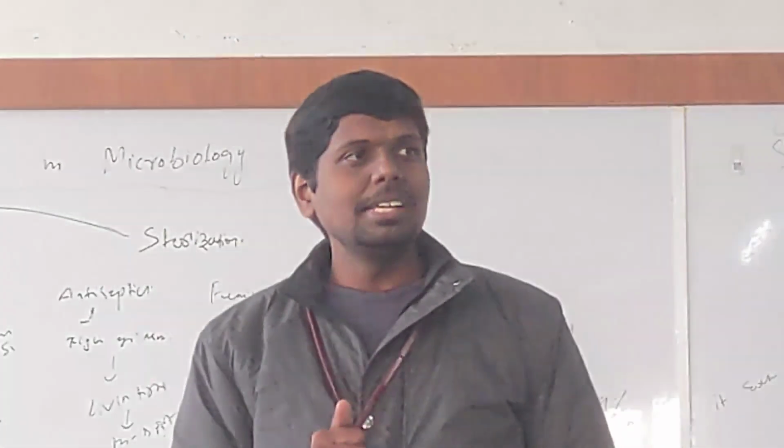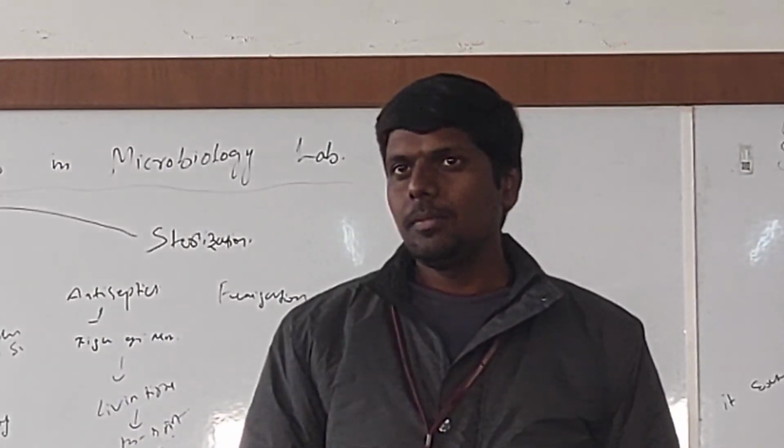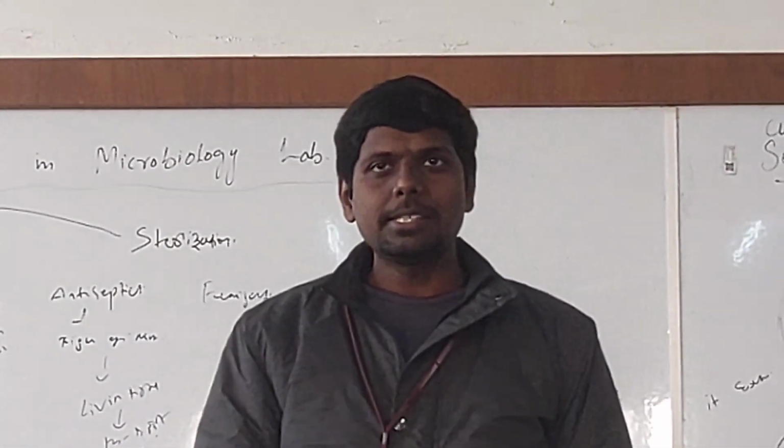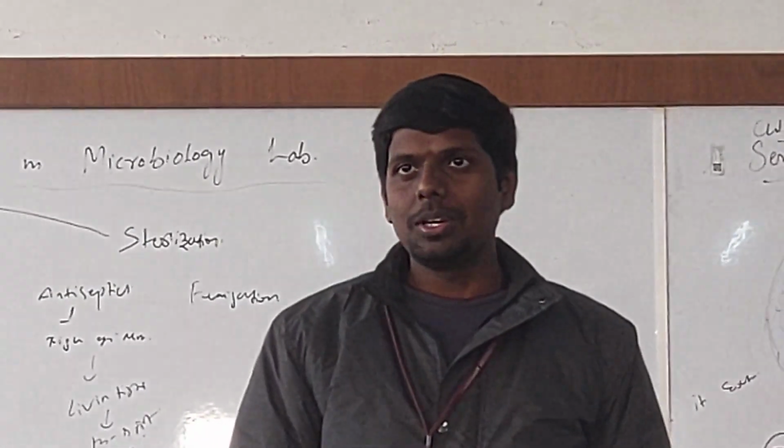Can I sterilize metals in the hot air oven, like blades, scalpels, forceps? They can be sterilizable.